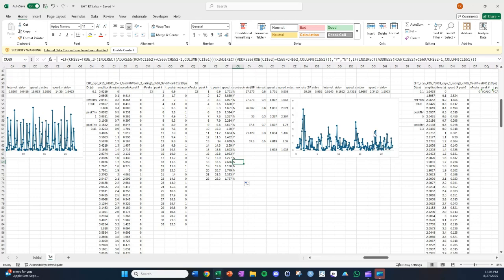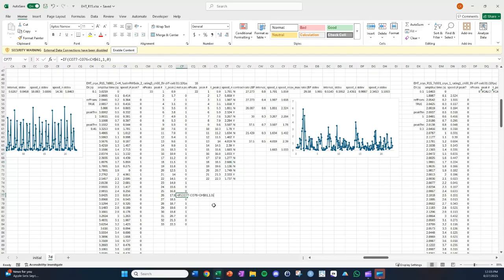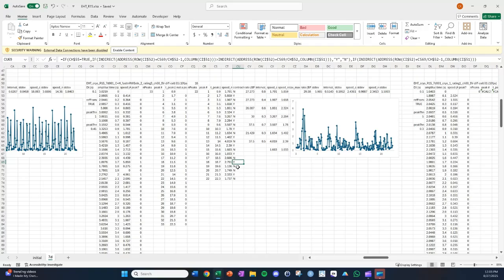And I think these are both. This is a beat together, so I'll try to hit both of those, 18.5 and 18.7. So I'll get rid of that one, and I'll include the 18.7 one. And now that's making sense. Relaxation followed by contraction there. That's good. That's a whole beat.